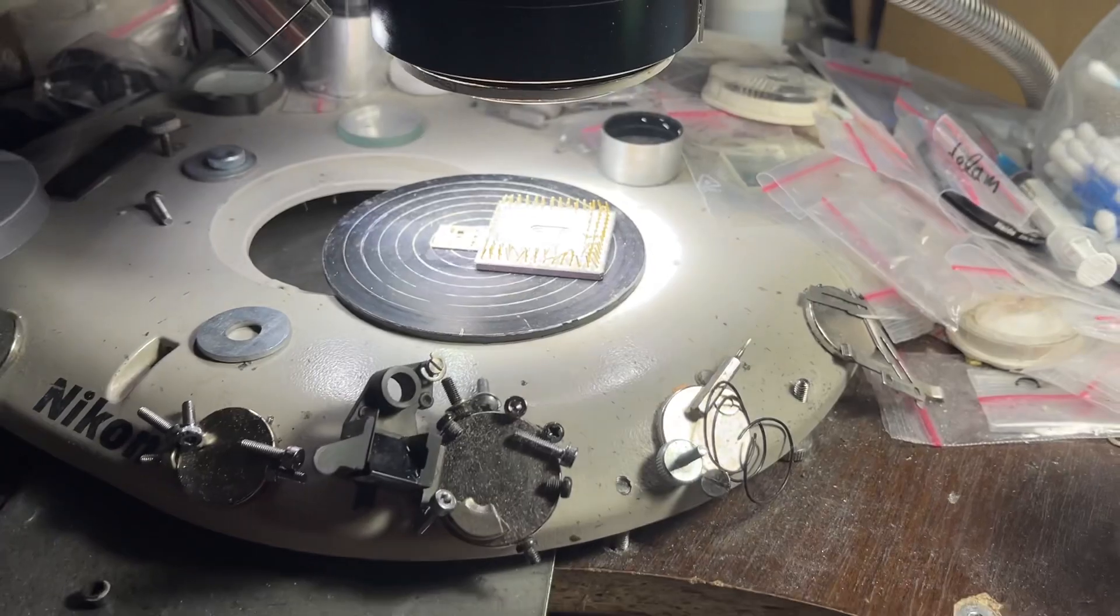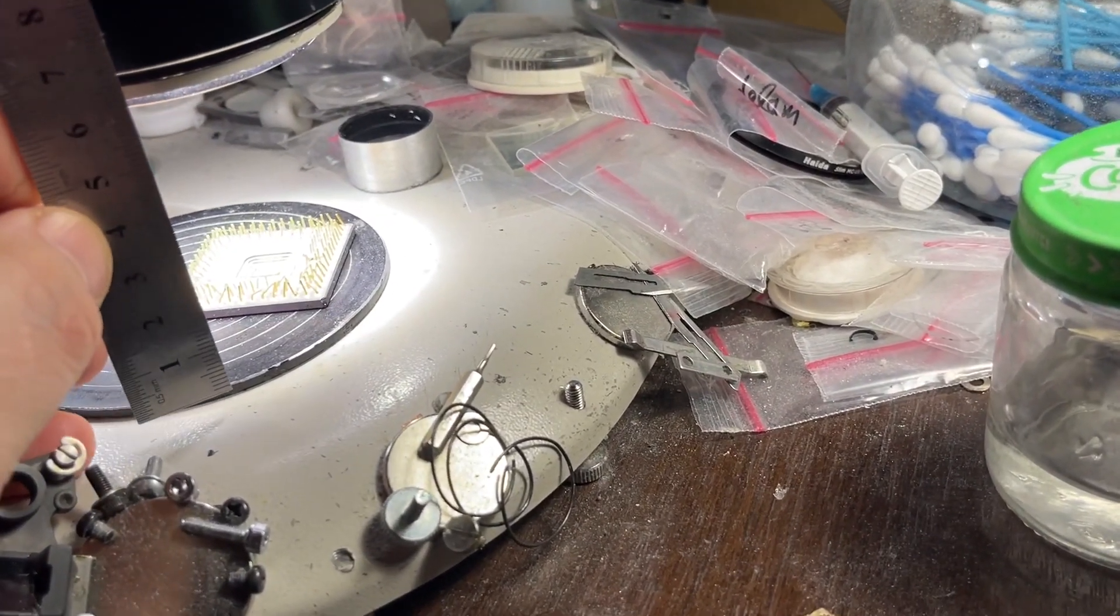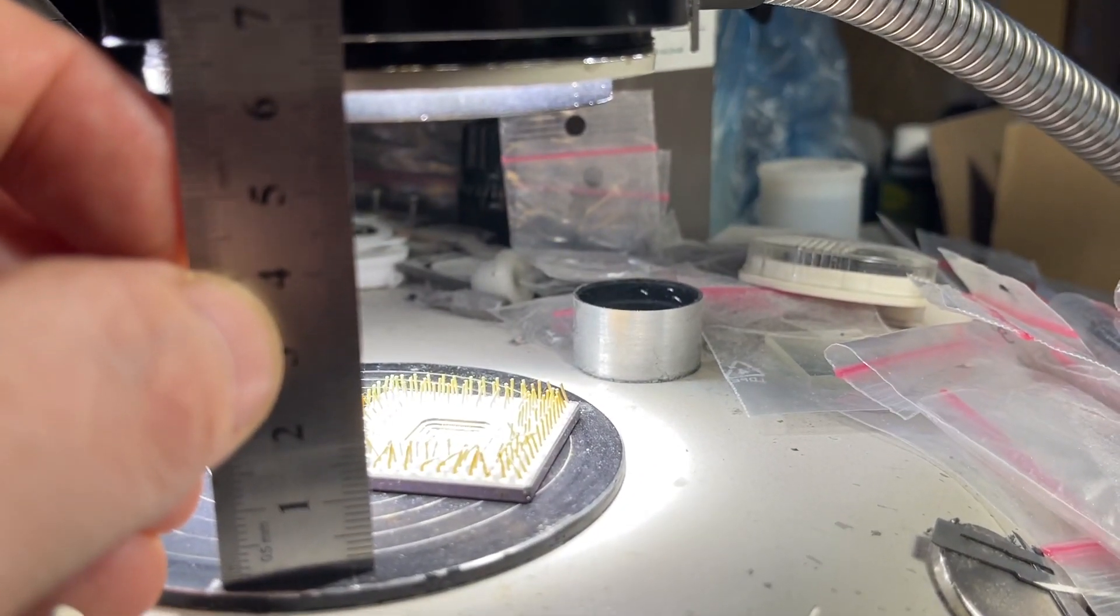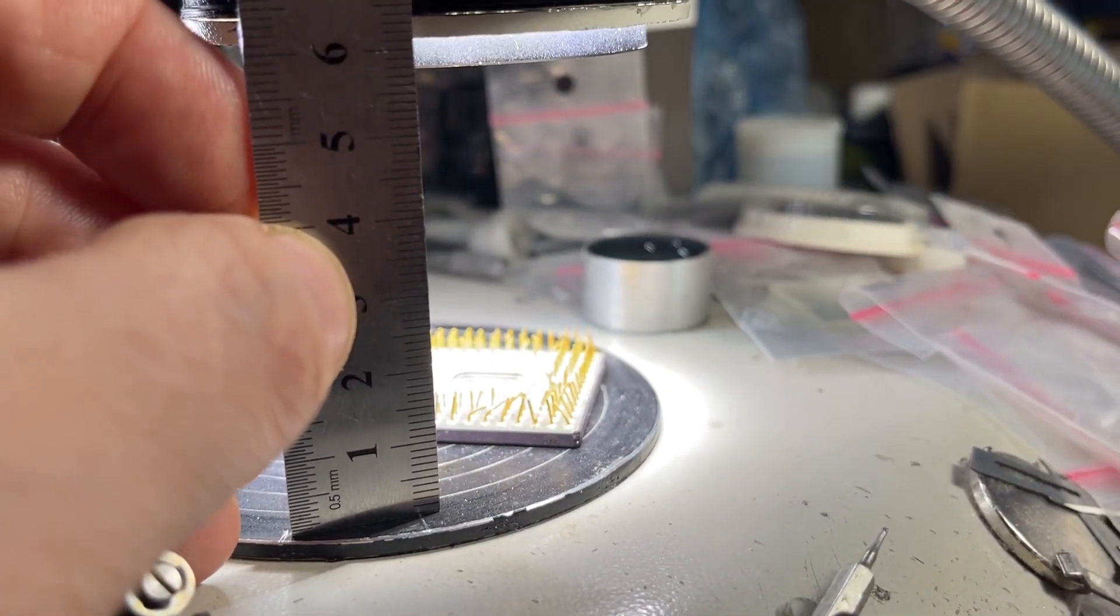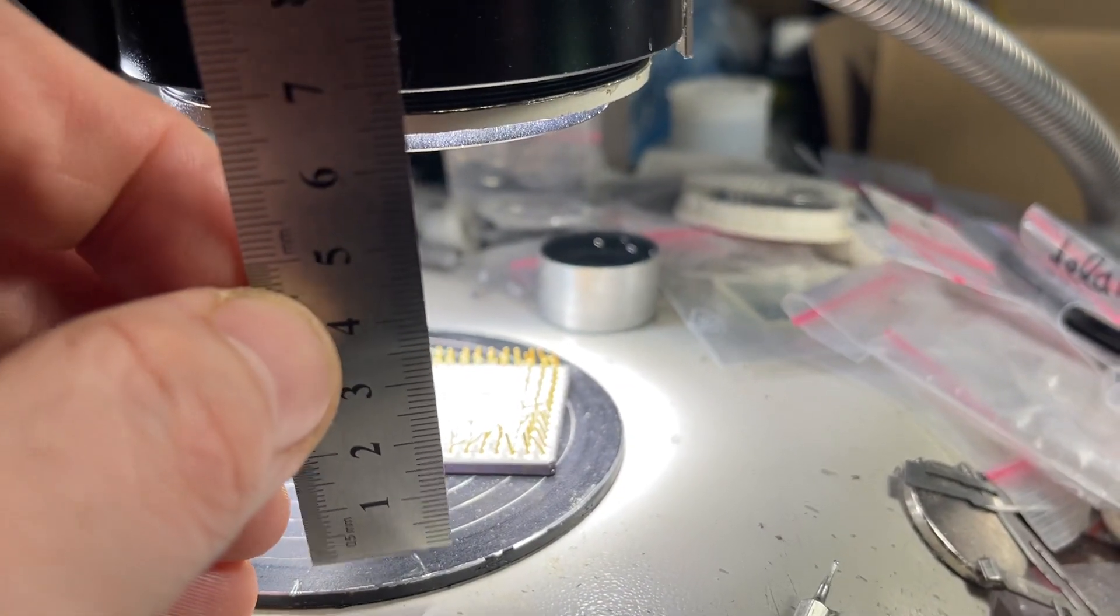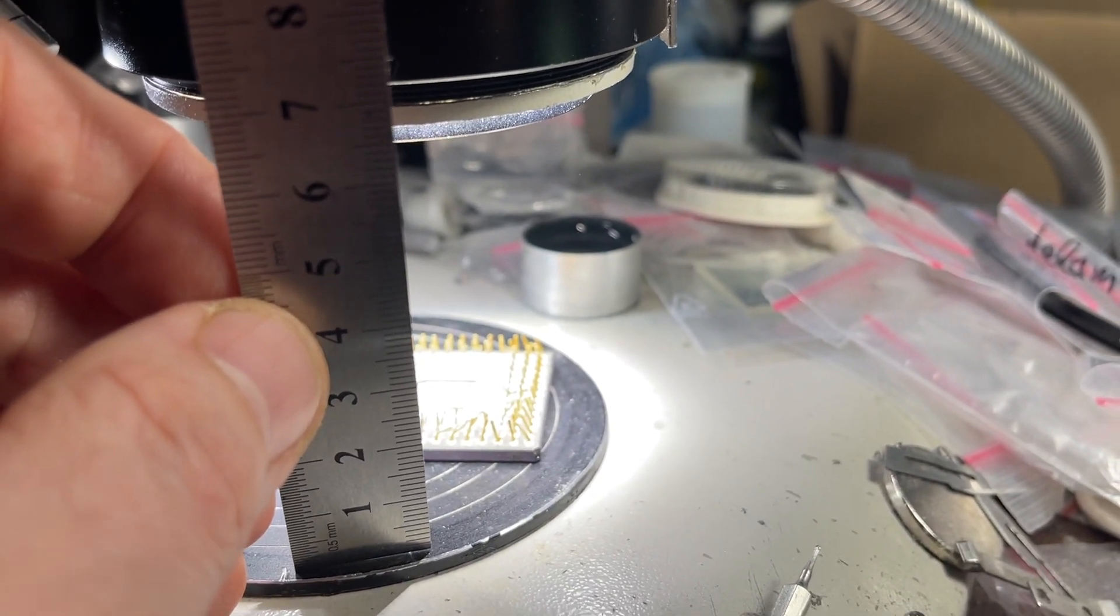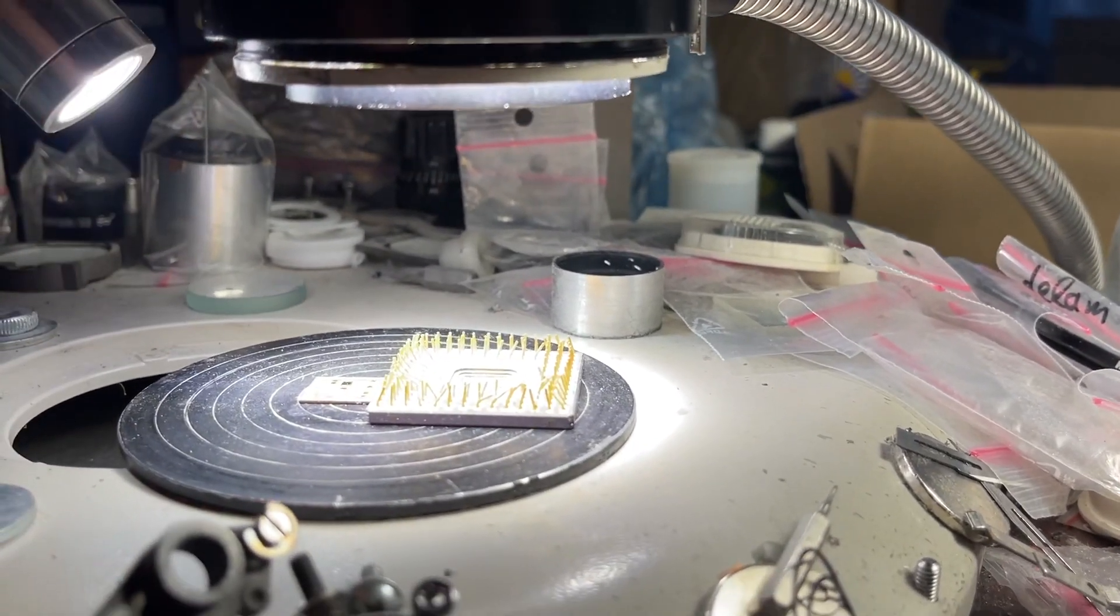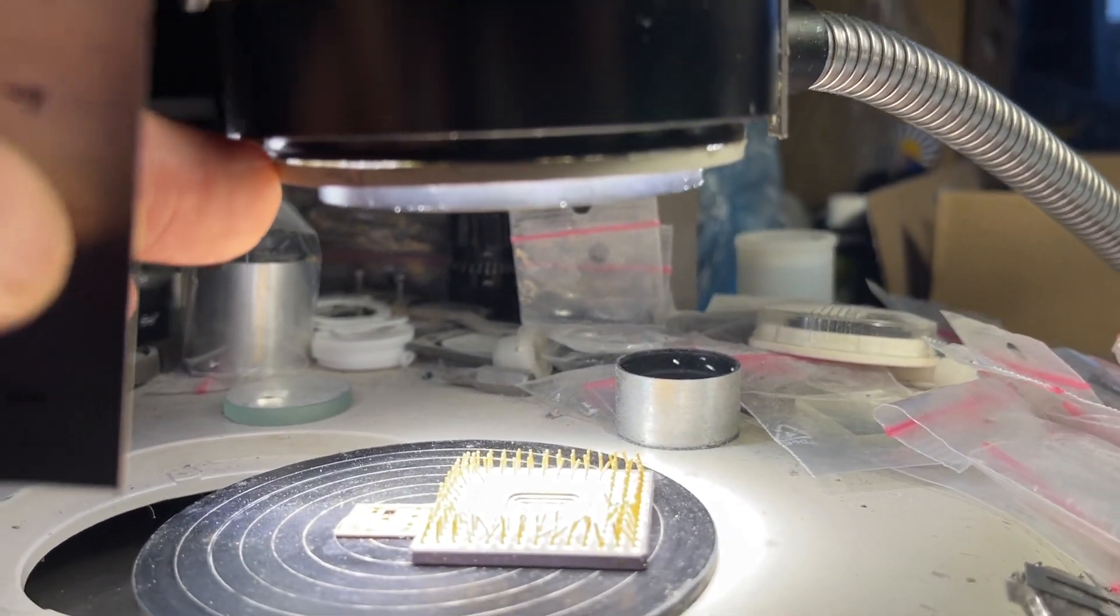But as a drawback from resolution, there's usually the working distance. In our case, working distance is 57 millimeters, not that much to be frank, but we can't increase resolution without changing some things connected to distance.